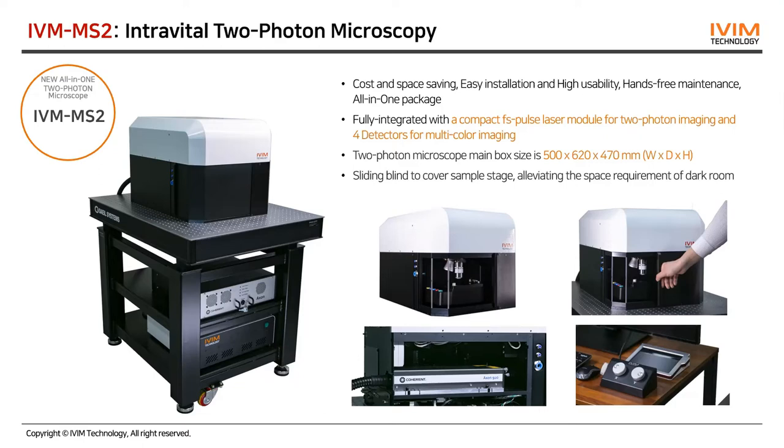We need a customization, but it's possible to build up the ablation and the laser cutting function as well.